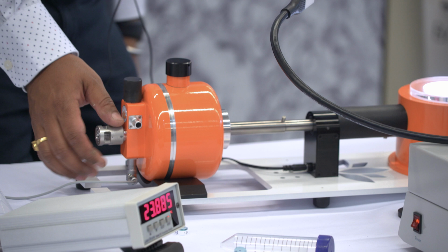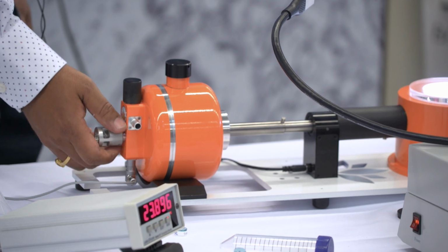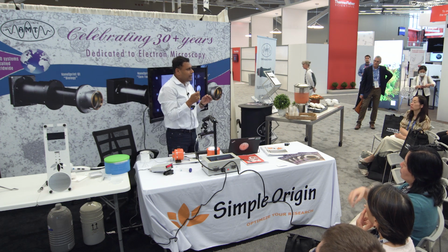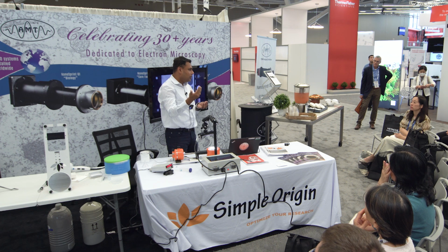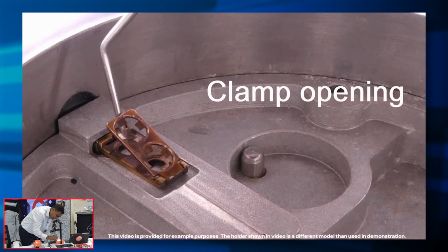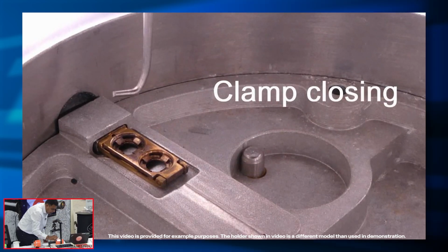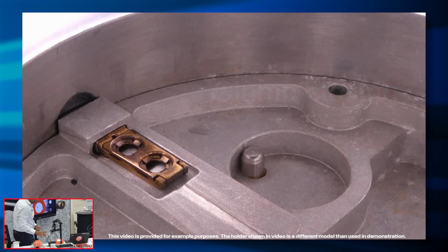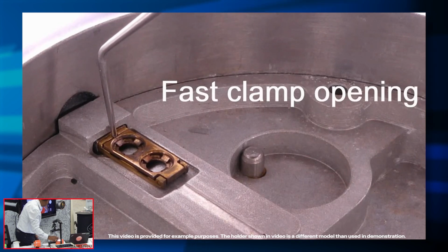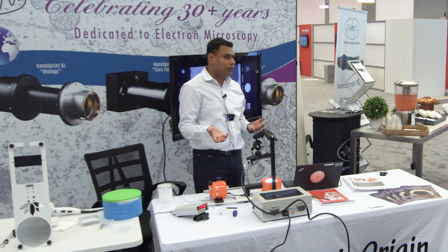Before you start the process, what we have here is a knob that you can slide the specimen stick out. We have a specimen tool, and the idea of the specimen tool is it's very lightweight and low profile, so you don't transfer heat energy from the tool itself to the holder when you're doing a cryo sample transfer. There's a slot in there that you put the tool in, and you gently rotate it. It lifts up the specimen clamp, and you see it. You leave the specimen clamp open before you start cooling, so you don't have to fidget with it when everything is cold.